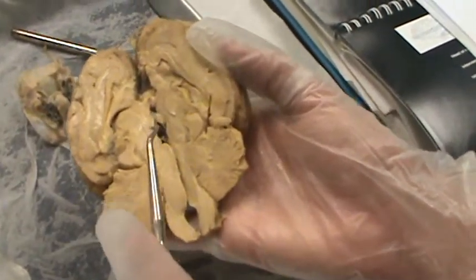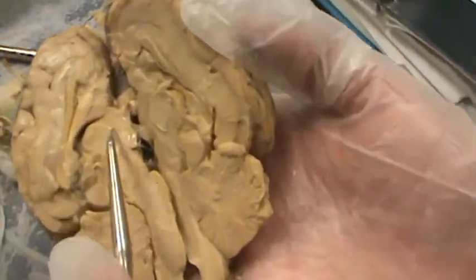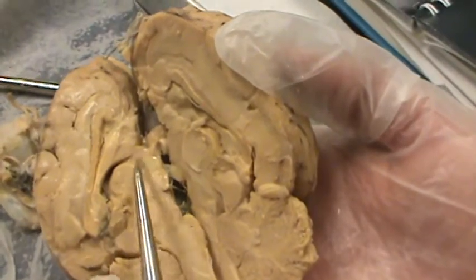The hypothalamus is inferior to the thalamus, so that would be here. Away from the cerebellum. Okay. Cerebellum, sorry. I heard hypothalamus.